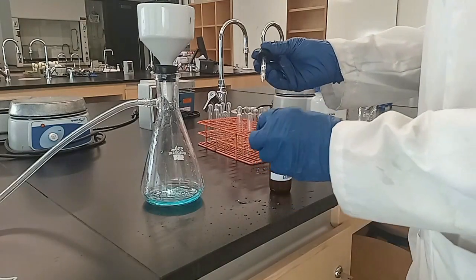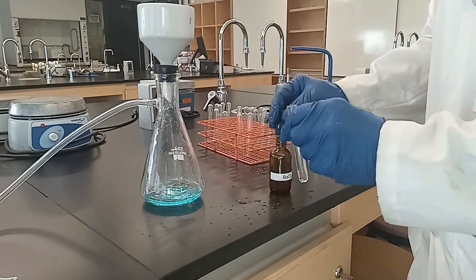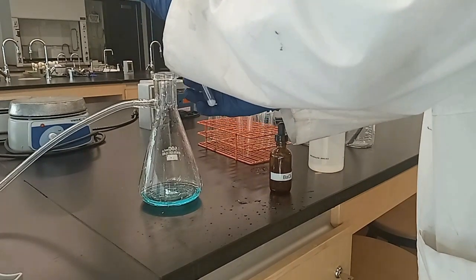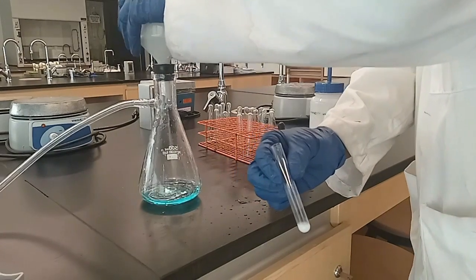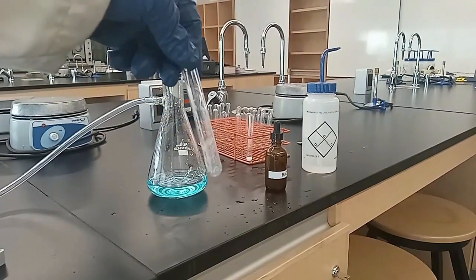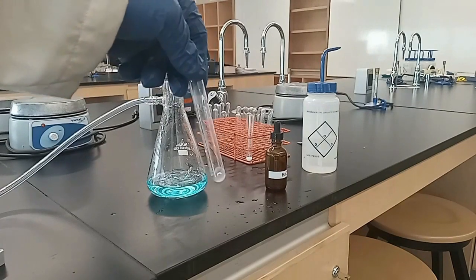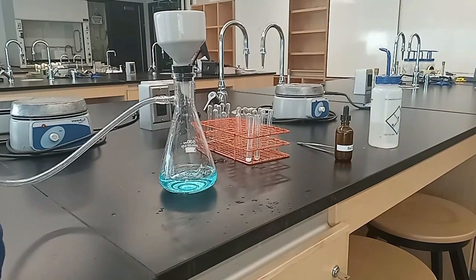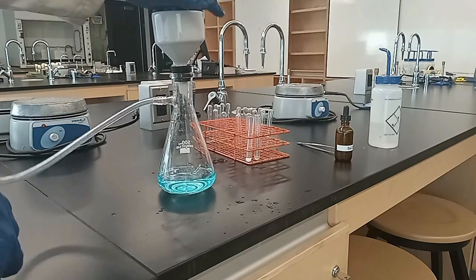Add a few drops of barium chloride in a test tube to test the filtrate for the presence of sulfates. A white precipitate indicates sulfates are present. Rinse the filter paper with distilled water until barium chloride remains clear when the filtrate is added.